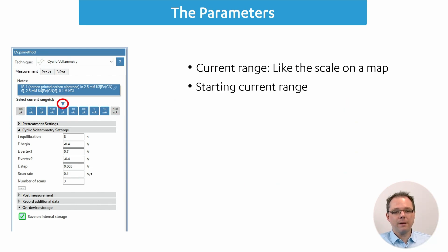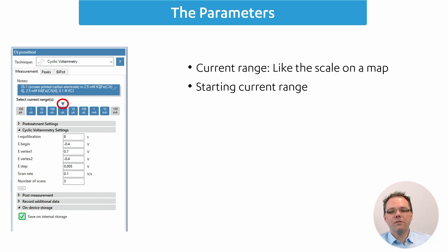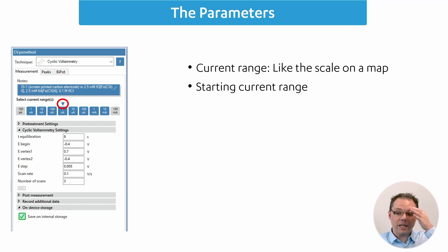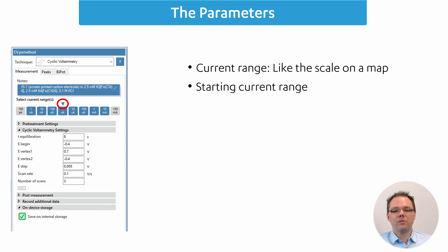For the current range, there is a little triangle — you may not have noticed it. The triangle tells you where you start, i.e., which current range is your starting current range. All the blue current ranges are available for autoranging, so the potentiostat will try to select the best one for your measurement. The triangle indicates the current range where the measurement starts.